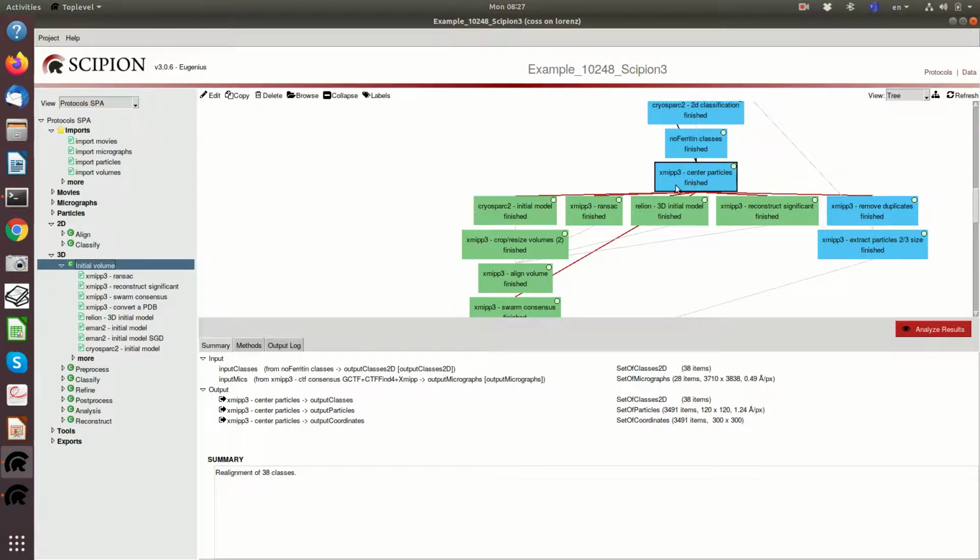And then they try to figure out how the particle looks like based on these images and classes. There are different mathematical rationales behind, and some of them are based on maximum likelihood, others are based on robust statistics, and they have different ideas. And the point is that the initial volume absolutely drives the reconstruction process.